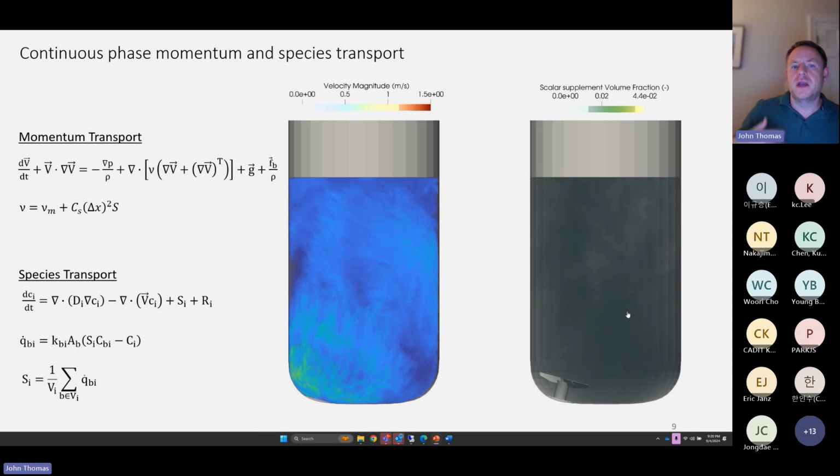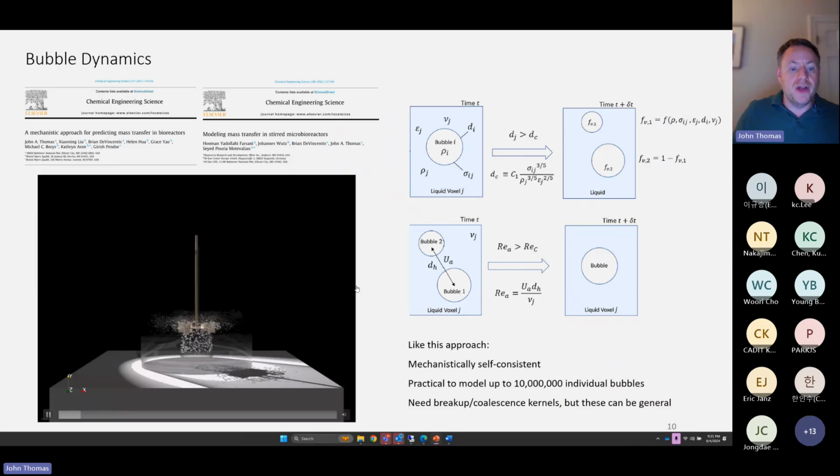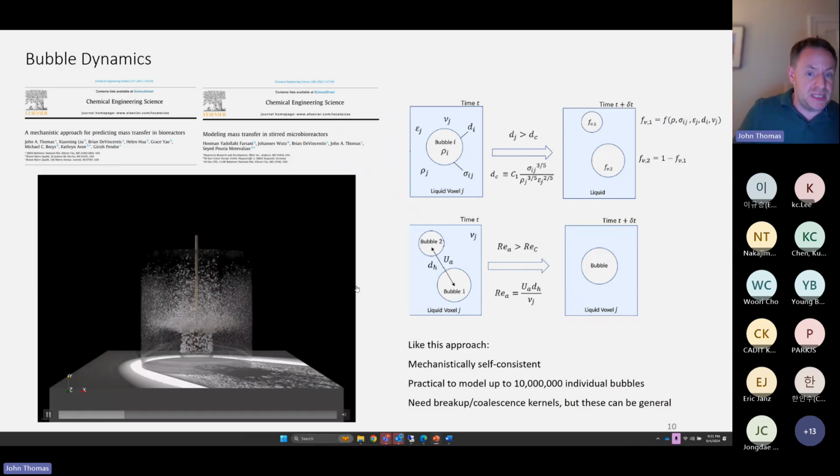And so importantly, we're modeling physics at the level of the individual transport carriers, and we're solving them in tandem and in real time, which means that changes in the viscosity due to changes in the glucose concentration do inform the time evolution of the Navier-Stokes equations and the resultant velocity field. Bubbles, again, as I mentioned, are modeled explicitly.